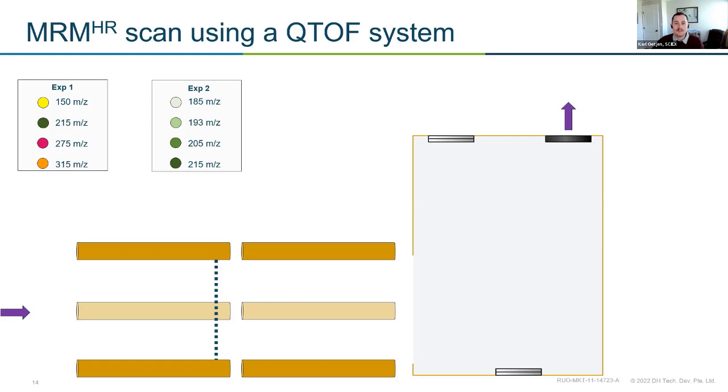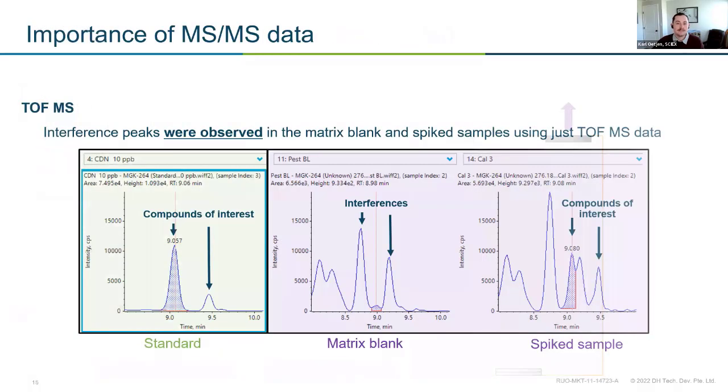We're still doing the same kind of thing. We're still optimizing for collision energy, but we are getting a different result because we have all of that fragmentation information that we can use, and we're going to use it a lot in the next coming slides. So I get asked this quite a bit. Why bother with the fragmentation information? If you have really high resolution, you can be really precise with the mass. Where does the fragmentation information come into play? And it can be really valuable.